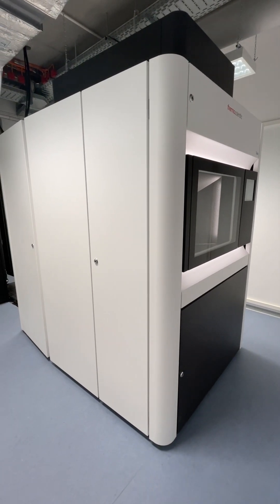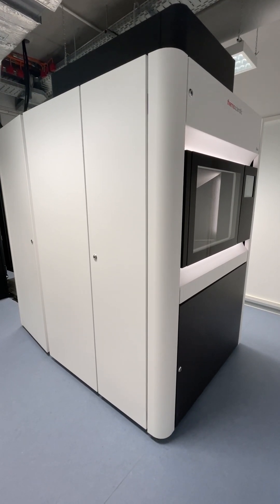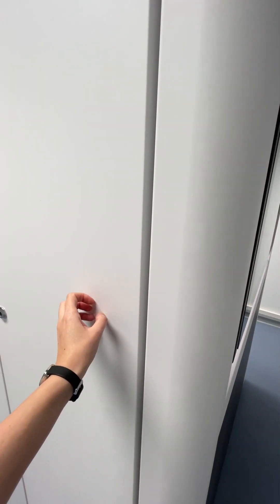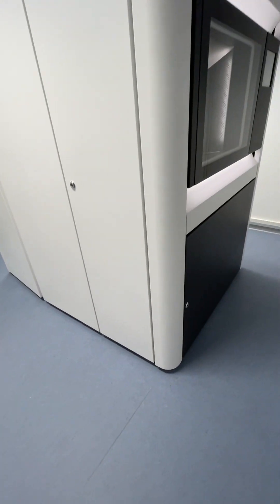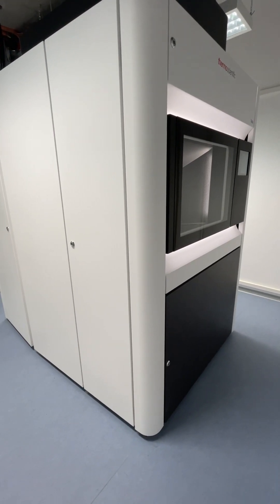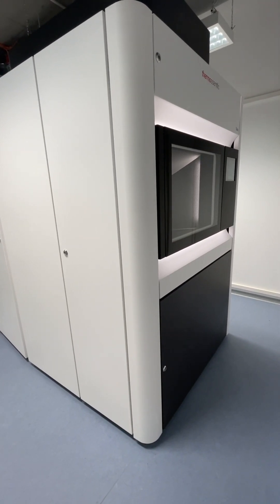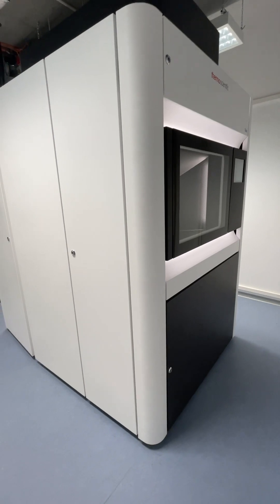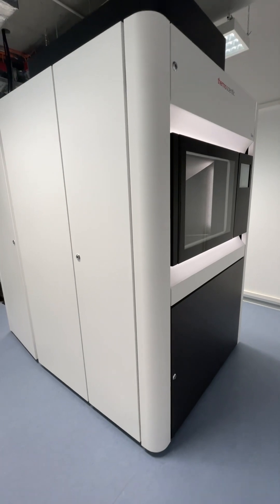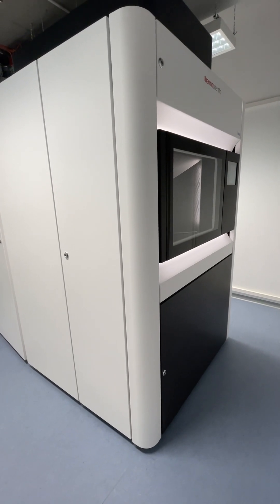If you've used TEMs before, you might notice this one looks a little different. It's very sleek and minimal because there's a housing unit around it. A lot has been done to the room itself to make it very stable, but this is another way to minimize environmental factors that could reduce data quality — things like air flowing across the microscope, vibrations, and slight temperature variations.